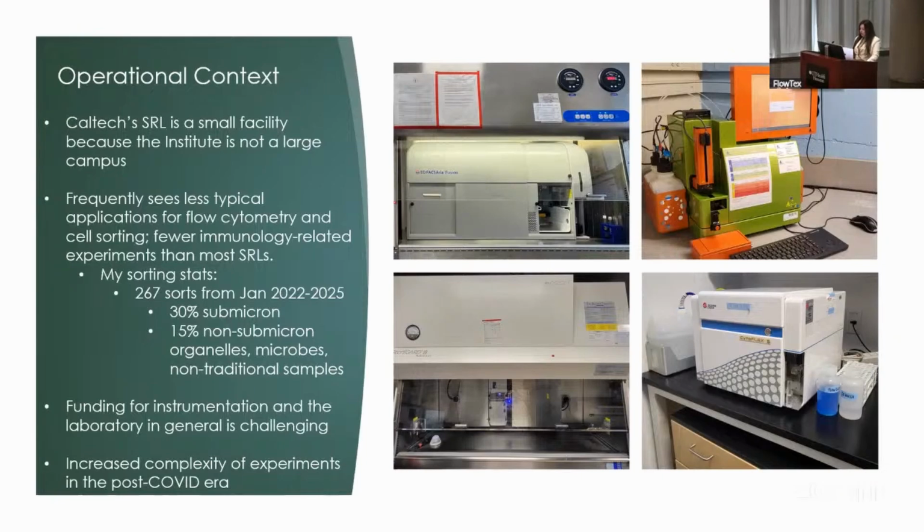And then finally, I want to highlight my co-author's contributions. He provided environmental samples and spent a lot of hours helping test instrumentation and providing feedback on results. Testing with seawater samples specifically provided a safe, ethical, and effective way to evaluate the new and existing equipment using BSL-1 biological samples instead of just beads. The results and protocols from testing with environmental samples will work for both mammalian cells and microbial cells.